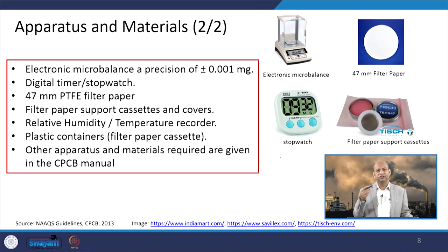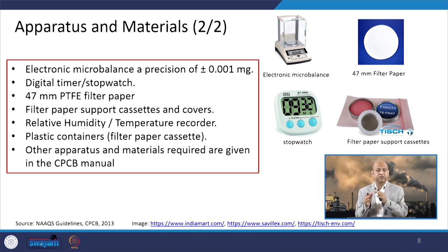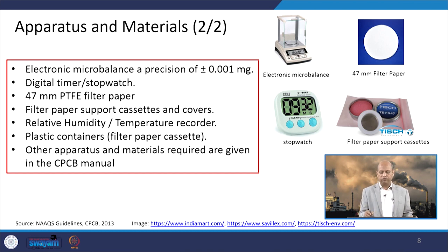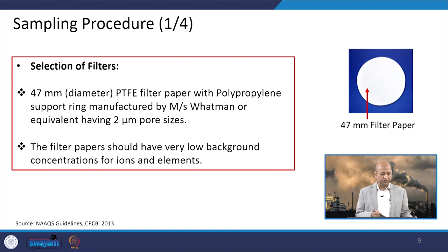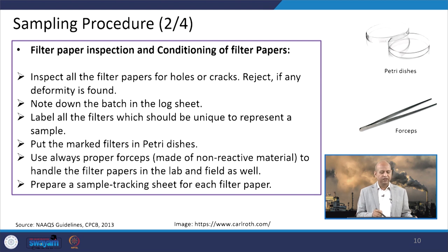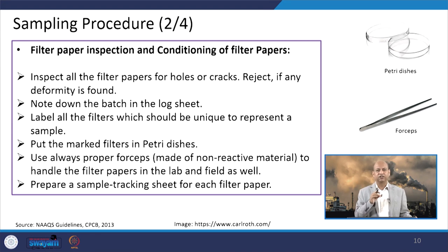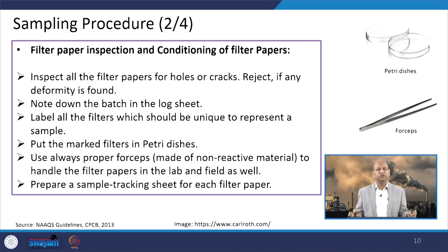We need to know how many hours we are doing sampling — 4 hours or 8 hours — and filter paper supporting cassettes are used so the filter is protected. This weighing machine is used for weighing the filter paper before and after sampling. In the sampling procedure, we first inspect the filter paper so that it does not have any holes — otherwise, particles will bypass through the punctured filter paper. If there are cracks or holes, we reject that filter paper; it should be completely intact.